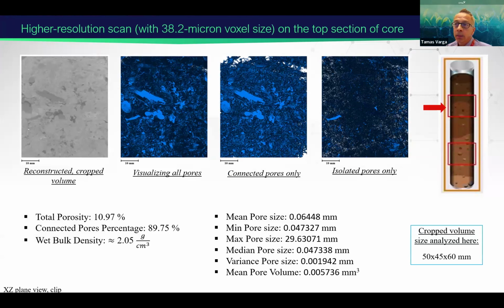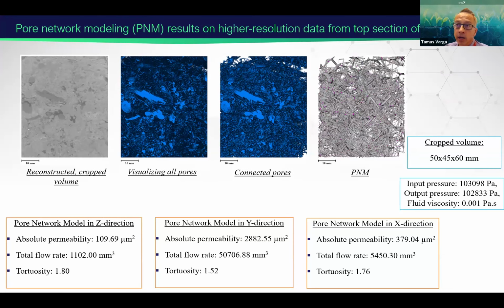And this is what Billy will talk about in the next talk. Here I'm just showing that on the high resolution scan, as you can see on the right, we do this detailed pore network analysis, identical for the top and bottom half, providing the porosity metrics, and also performing pore network analysis for pore connectivity and image-based estimation of flow and transport properties.